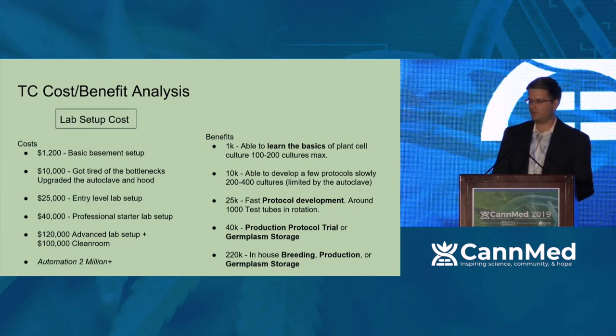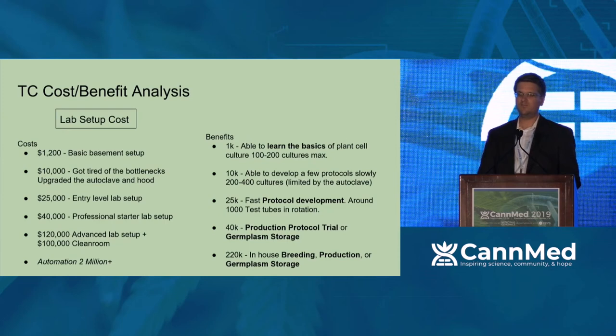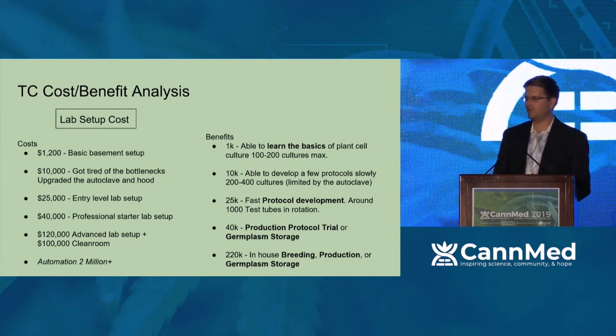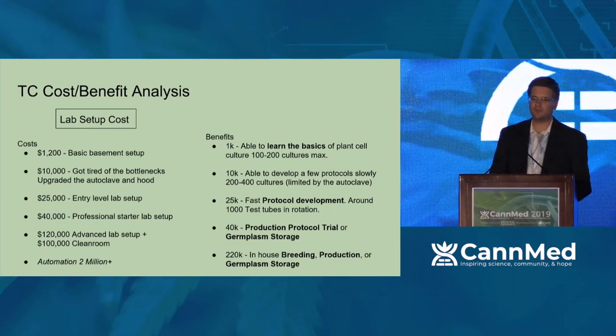You can always go a little bit cheaper if you need to, but that $40,000 range allows you to get a good hood, a good autoclave, and really put your plants through culture efficiently and successfully, while having the ability to trial some other medias and some other hormones just to make sure you're not basically shooting yourself in the foot. That being said, if you go more expensive labs, you are still able to do in-house breeding techniques, you're still able to do production and all that.